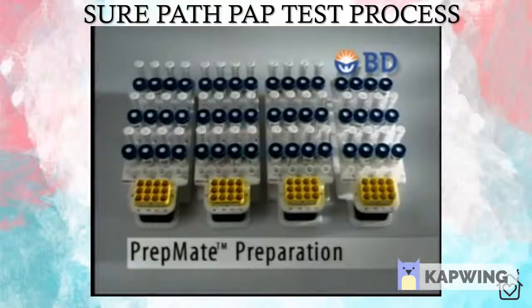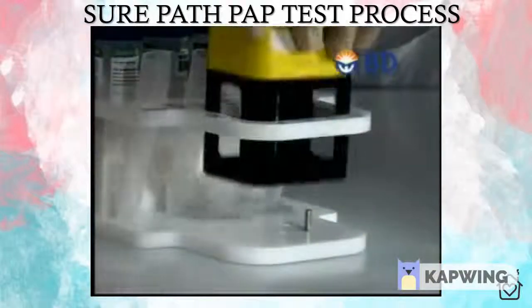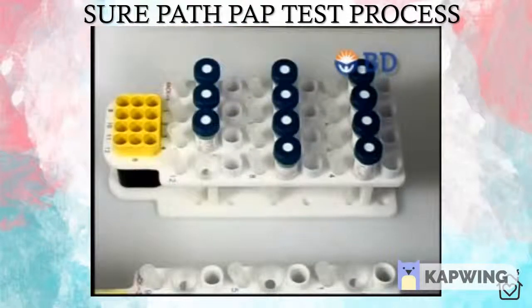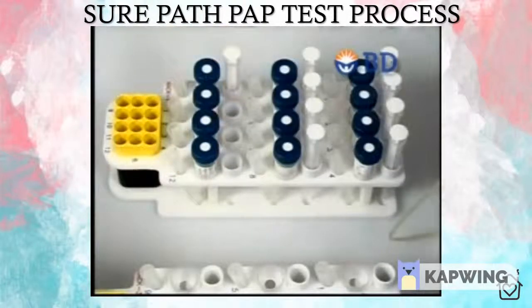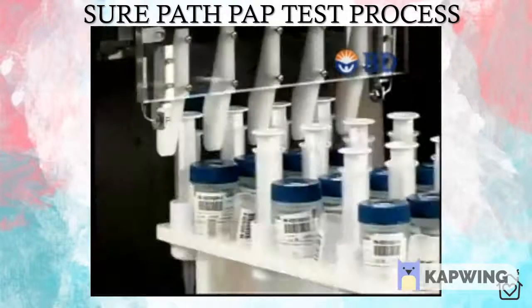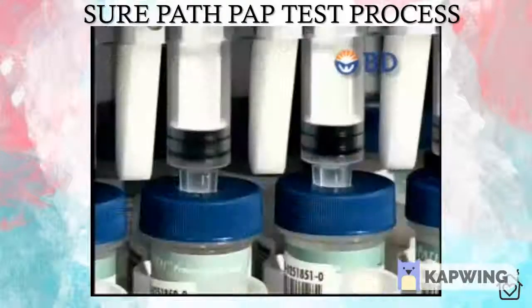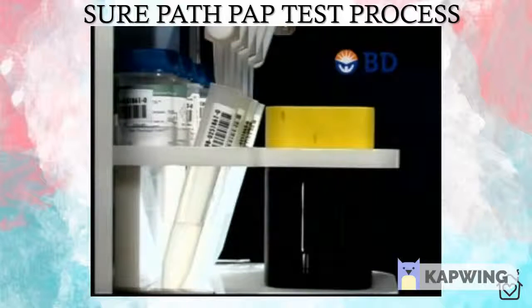Four PrepMate processing racks are provided and enable the organization and processing of samples. Each rack is numbered and keyed to accept only its corresponding centrifuge rack. This keyed system is maintained throughout the process, ensuring samples are always properly oriented. A PrepMate rack is loaded with SurePath specimen vials and corresponding centrifuge tubes. Four milliliters of density reagent are dispensed into each centrifuge tube. A disposable PrepMate syringe is placed adjacent to each specimen vial and the rack is loaded onto the automated PrepMate accessory, which automates this phase.